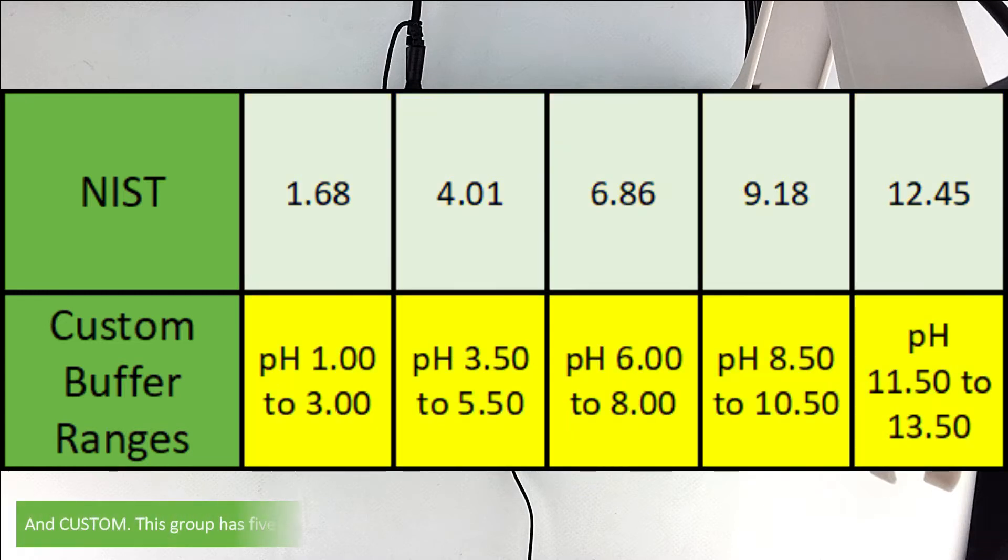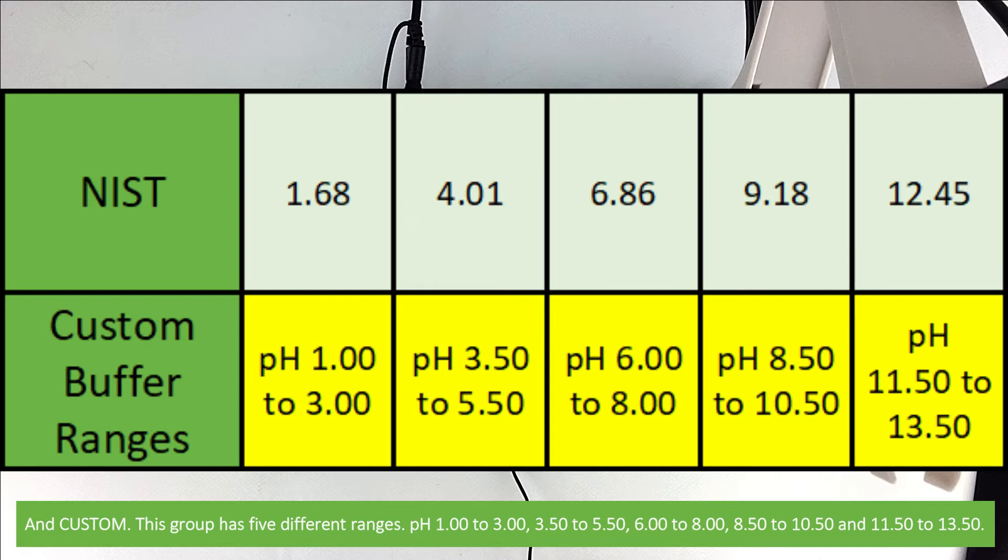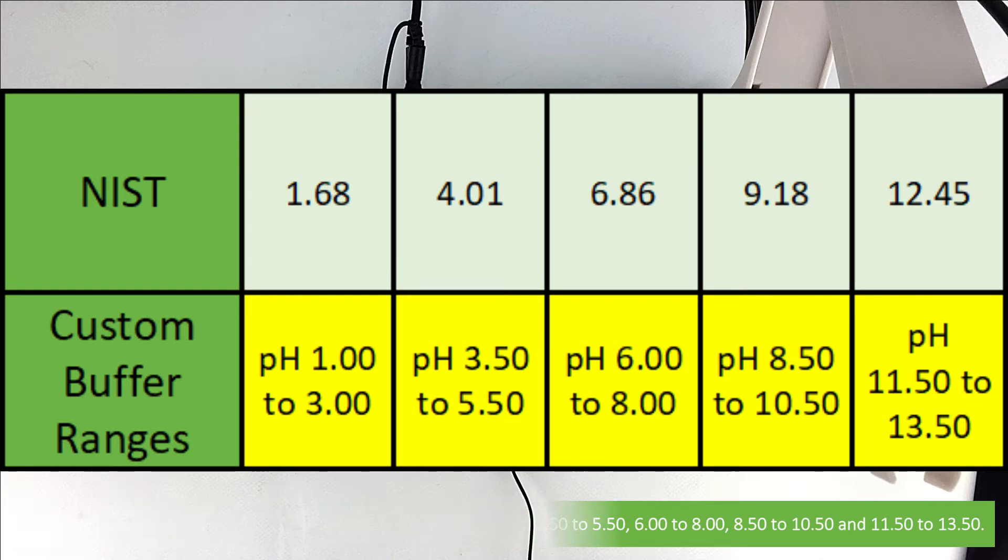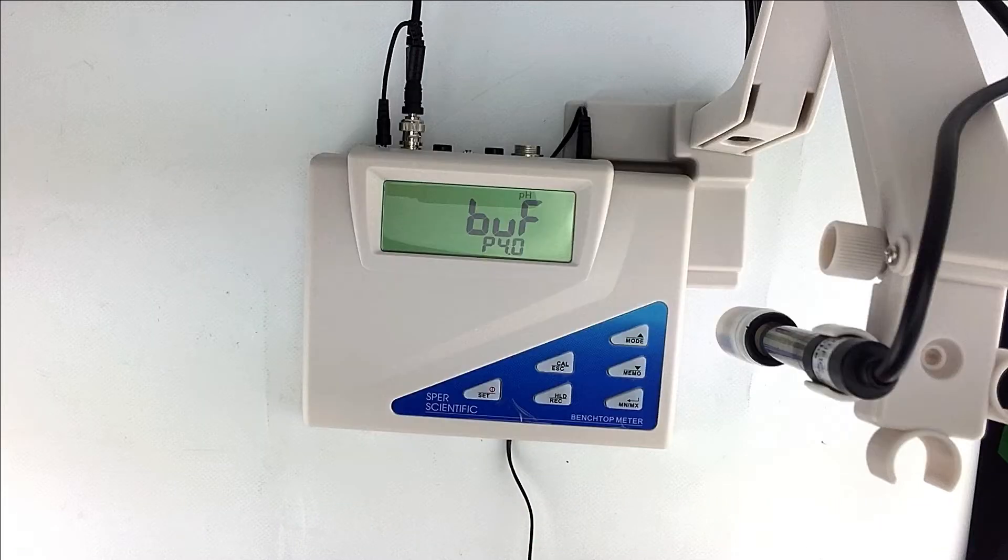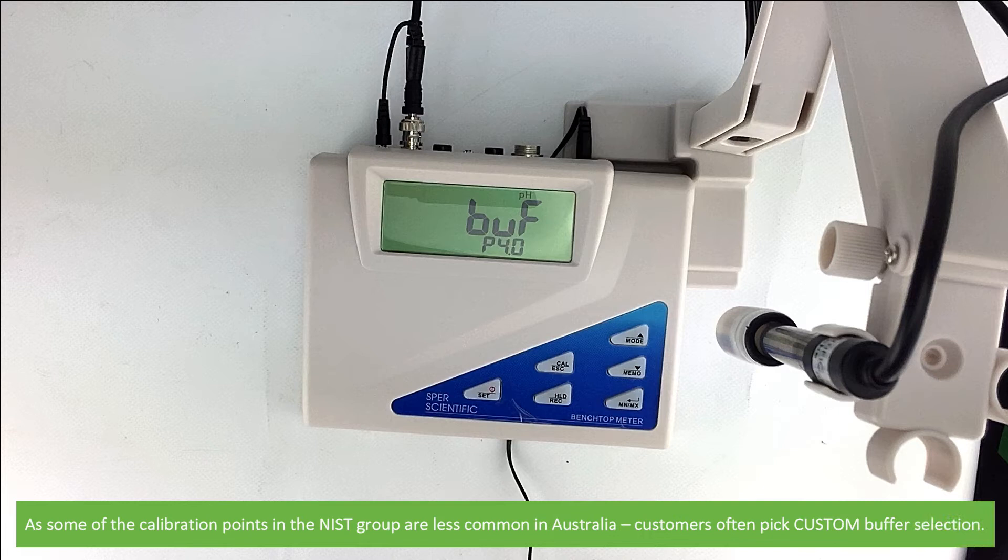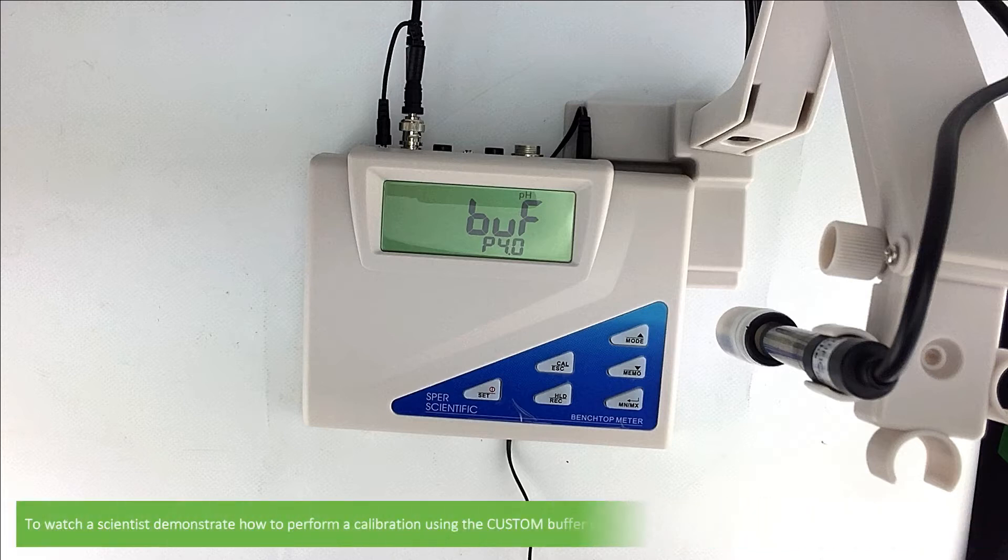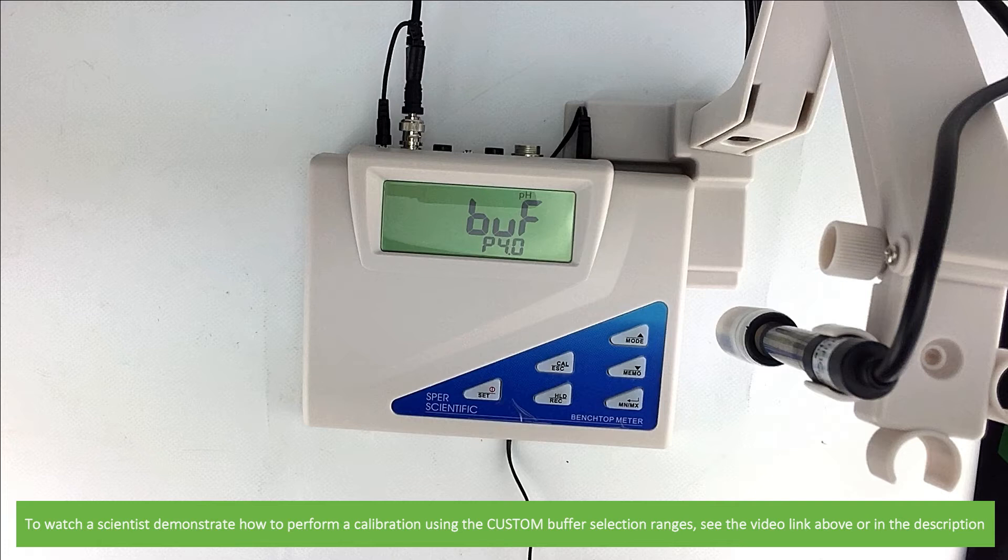And custom. This group has five different ranges of pH buffers. These are pH 1 to 3, 3.5 to 5.5, 6 to 8, 8.5 to 10.5 and 11.5 to 13.5. As some of the calibration set points in the NIST group are less common in Australia, customers often pick custom buffer selection. To watch a scientist demonstrate how to perform a calibration using the custom buffer selection ranges, see the video linked above or in the video description.